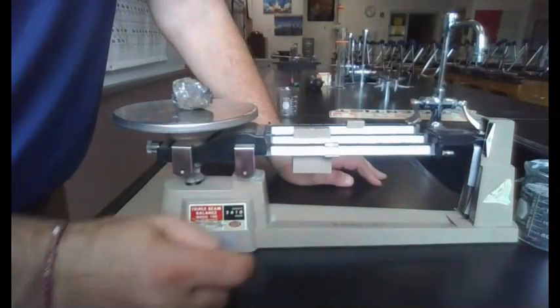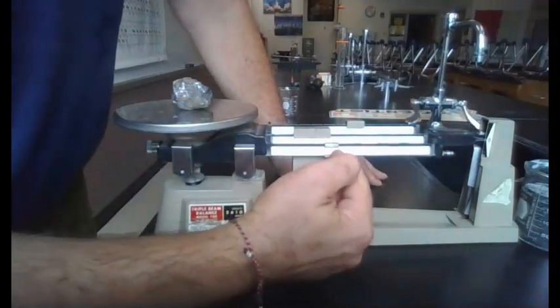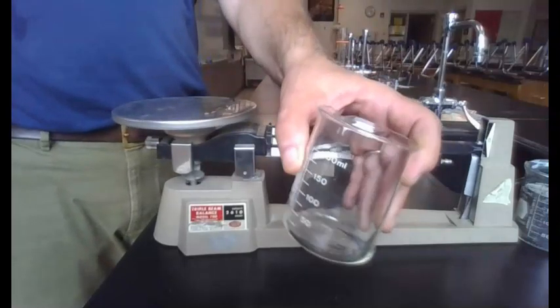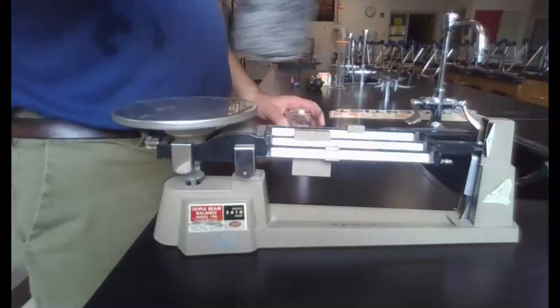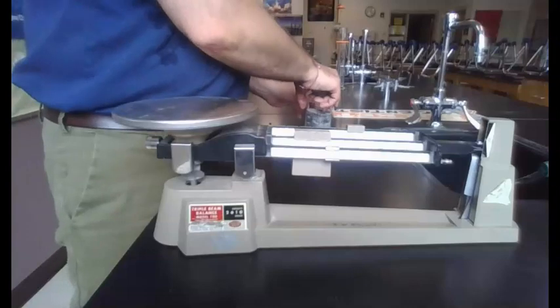So 0.70. That's how we read it. 163.70. If we wanted to do the weight without the container, we would have to weigh the container first and then weigh the container with the material and subtract. You have to do a little math on a piece of paper.